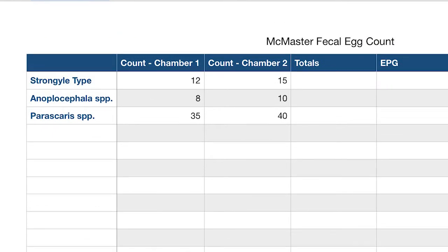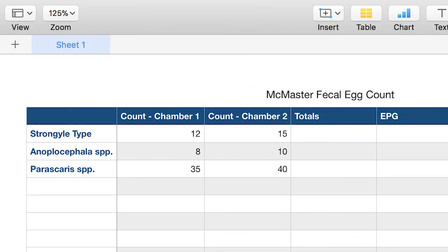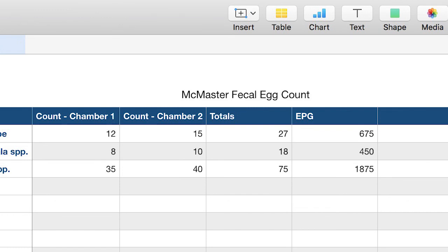Once you have finished, you're going to add up all of your egg totals and then multiply them by 25 for horses to get your total eggs per gram.